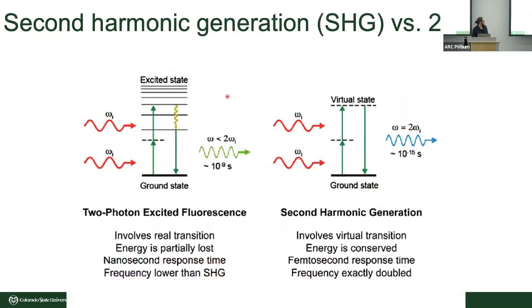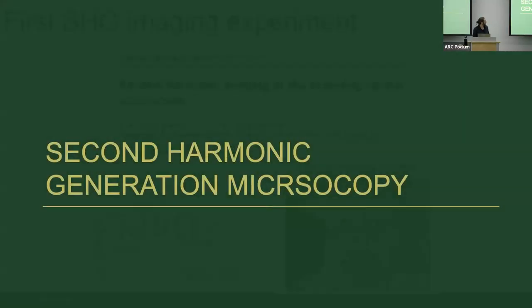So we talked about this already a little bit, how in two photon, we have two photon absorption. We have two photons come in that are actually absorbed. They show up roughly at the same time. They are absorbed by the molecule. And then there's some sort of random stochastic decay to the bottom of the excited state, which then decays to give us our fluorescence. And that random nature is what gives us this incoherent process. In second harmonic generation, those two photons scatter and they maintain this coherence, right? Angular momentum is conserved and we wind up with something that has a coherent response.